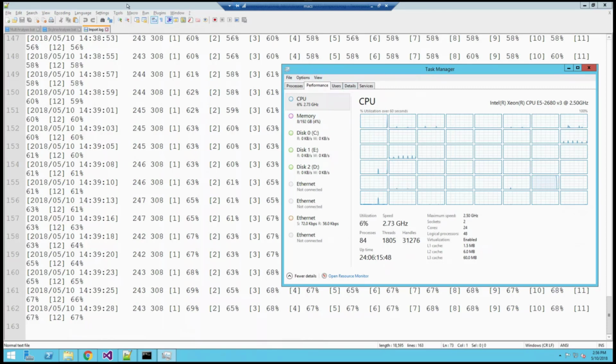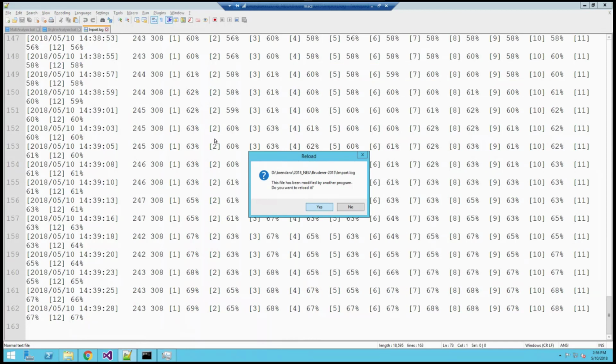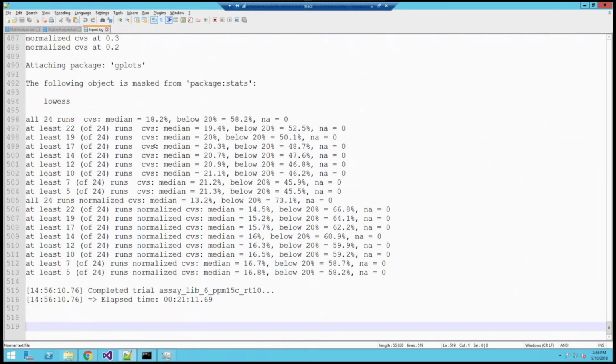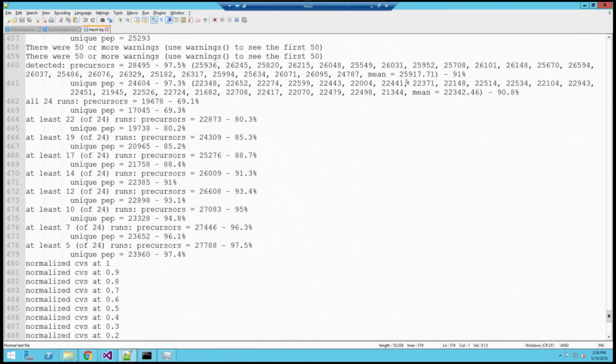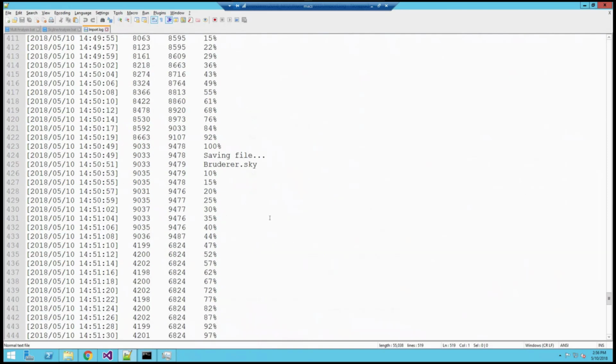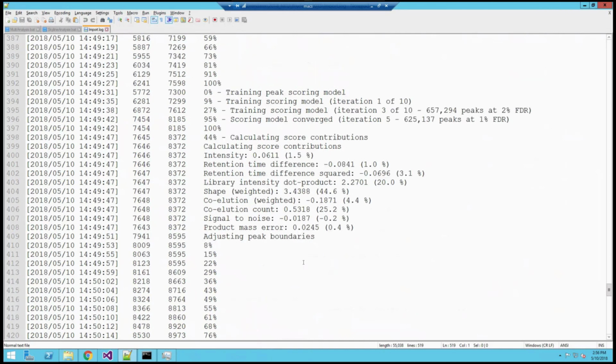So if I go here, and I can go to the end, you can see that this is output from the R script. You can see up here is the end. It's saving, and here's where it built the model, and this model should look very familiar, right?